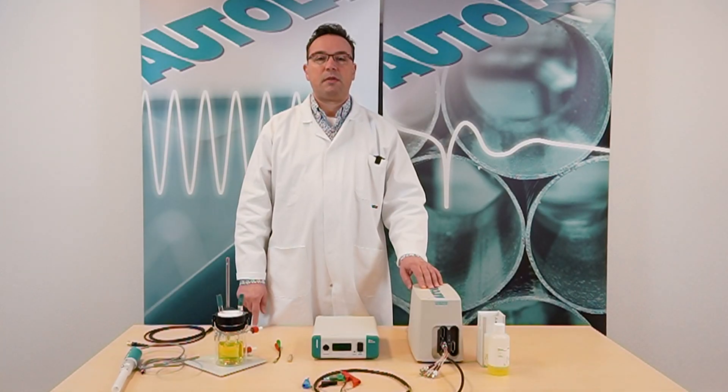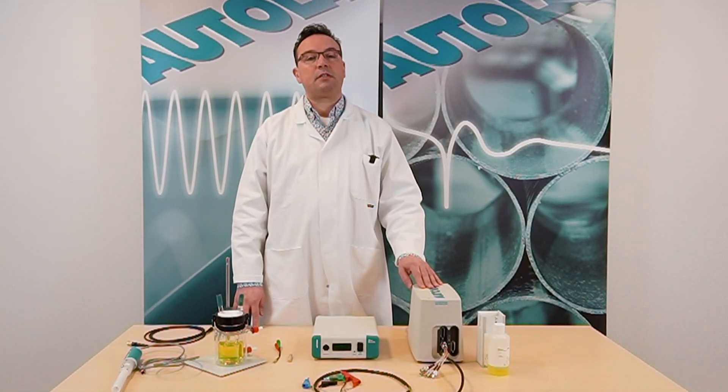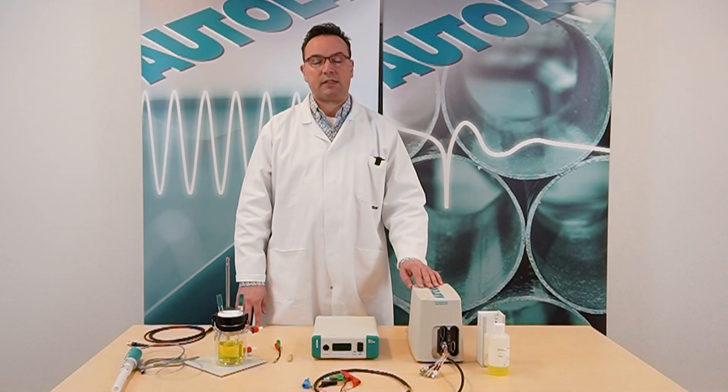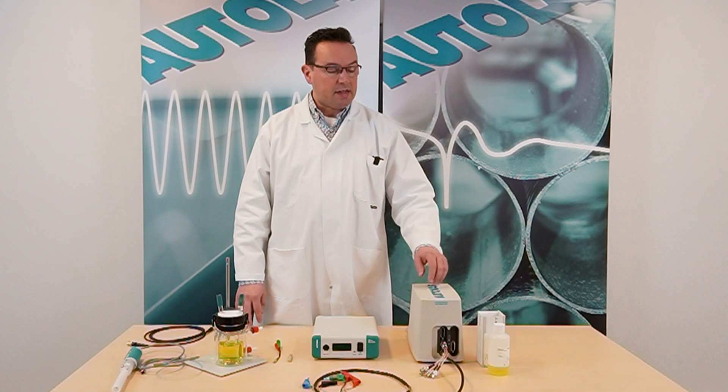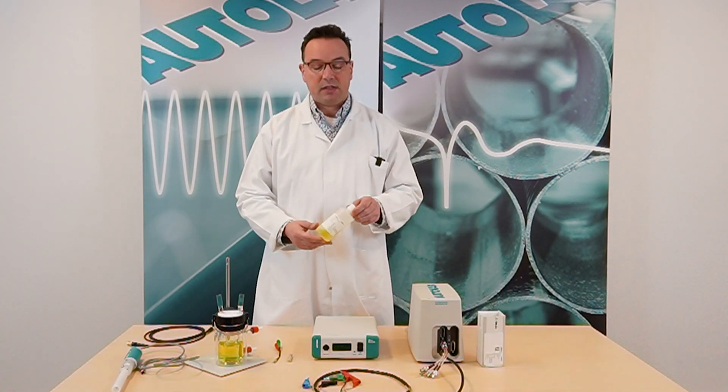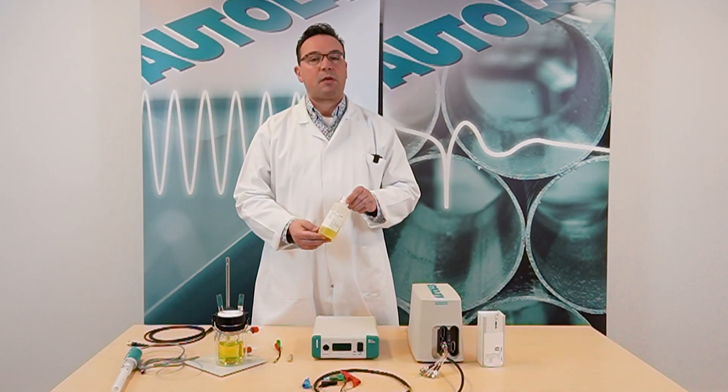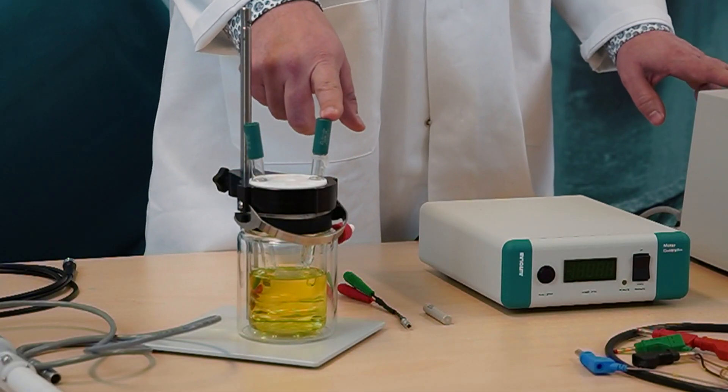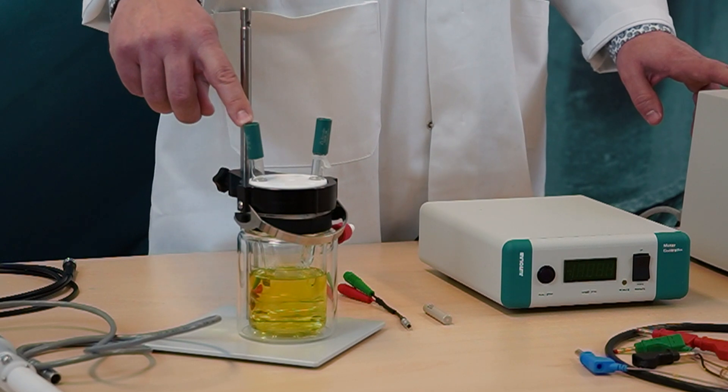The following experiment we are going to study the mass transport characteristics of ferro-ferri redox reaction using the Autolab rotating disc electrode. The electrolyte used in this experiment is a redox standard which can be purchased from Metrohm. We use a standard silver-silver chloride reference electrode and a platinum sheet counter electrode.